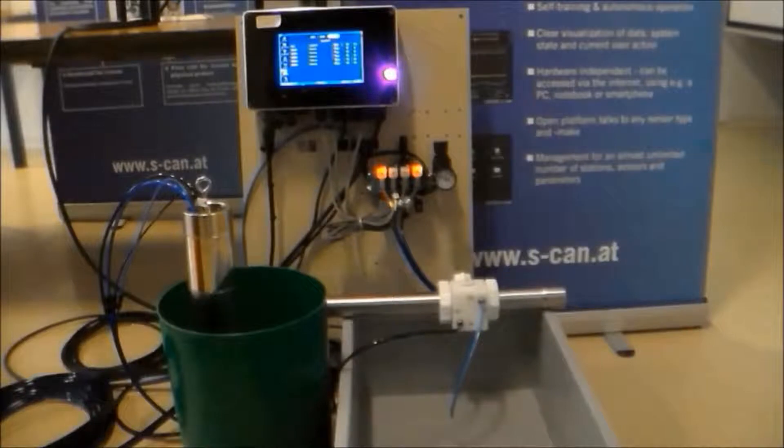This procedure can be repeated in any order before or after each measurement as no external PLC is required for this. All actions are fulfilled by CONCUB and MONITOOL.